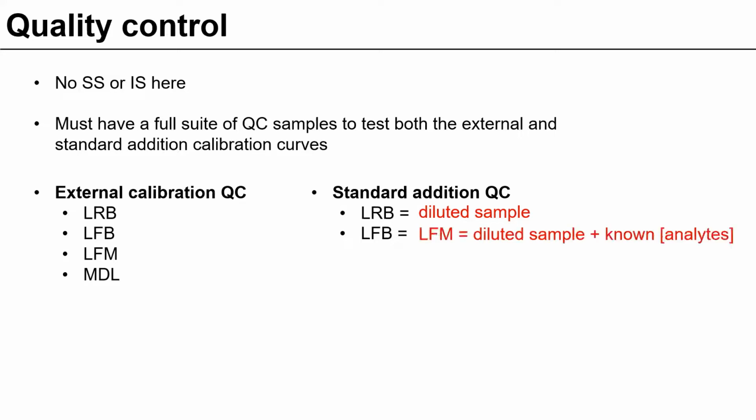We could run an LFB, but our LFB is going to have matrix in it because we have to add the sample to all of our solutions. So our LFB is going to be essentially an LFM. And then can we run an MDL sample? Yes, we can, because that's going to be our diluted sample plus a small amount of our analyte.